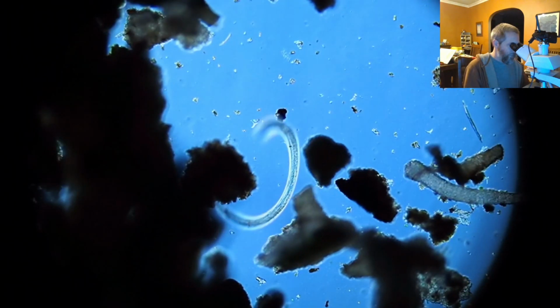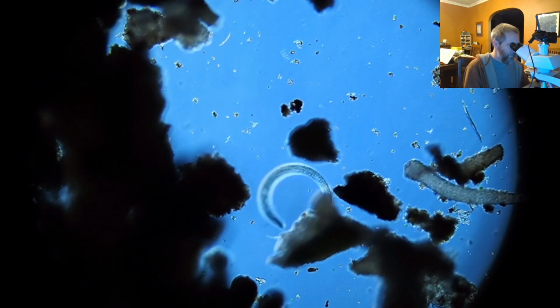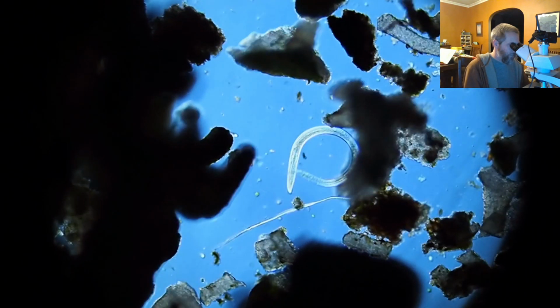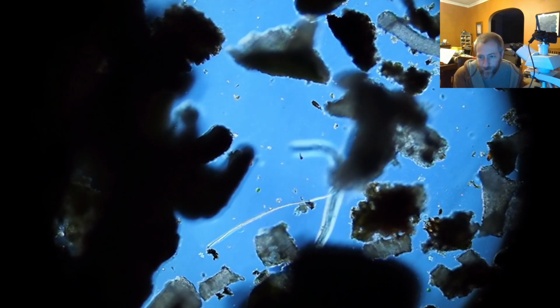Here's another little wiggly nematode. So the nematode worms are also extremophiles. When the sample started, everything was completely dry and was on a stick, basically.